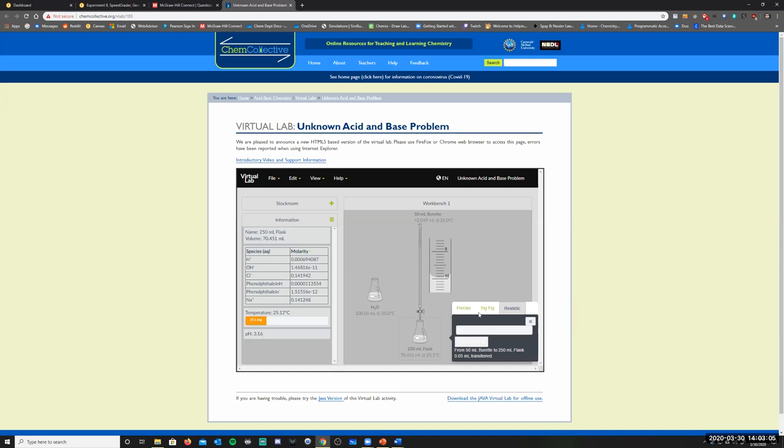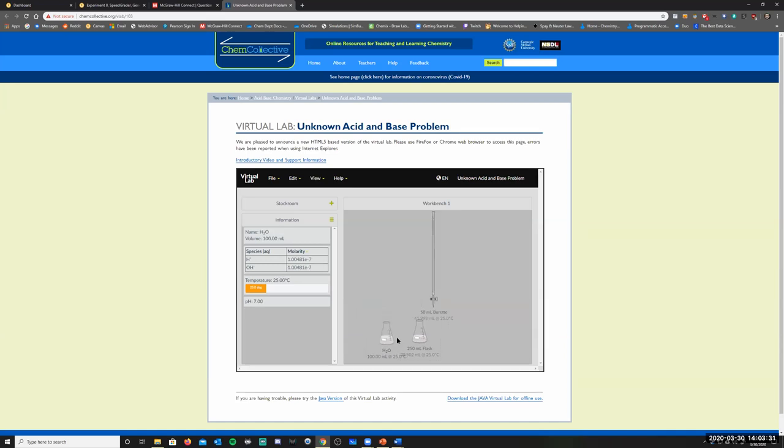Let's do, so maybe we do real slow now. 0.01. And now it turned pink. See that? So that's why it's good to have a clear one with pure water next to it, because it can be hard to tell that it's turned pink here without having a clear one next to it to notice that, oh yeah, these are different colors.